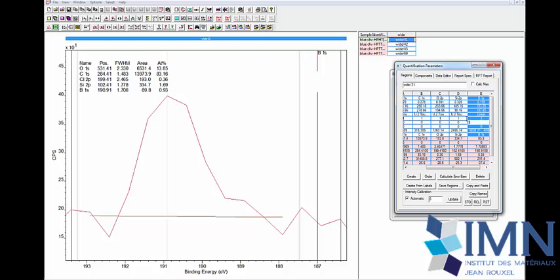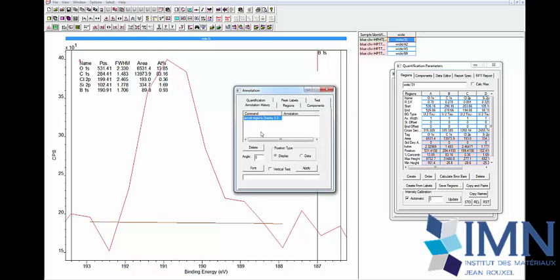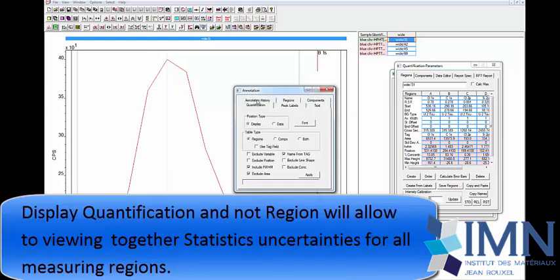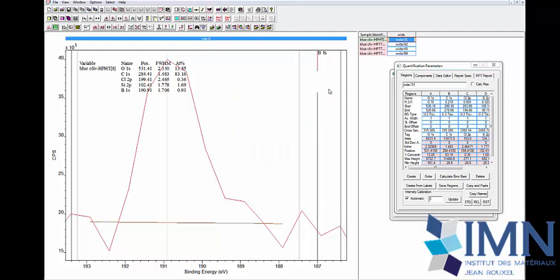We choose an average of 2, meaning 5 points right and left. That will give us a better knowledge of the exact position of the background. Of course, the choice of the limit could be discussed. It's never easy to find a perfect solution. I try to do something realistic. And now, okay, it's done for the first sample.